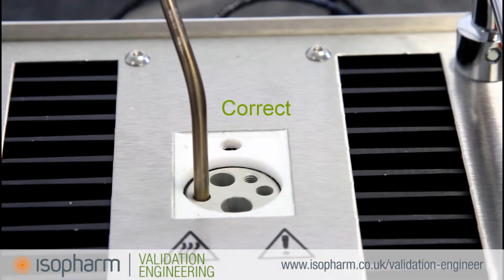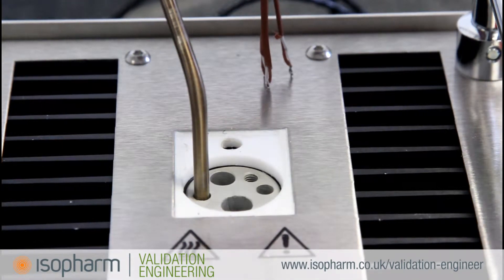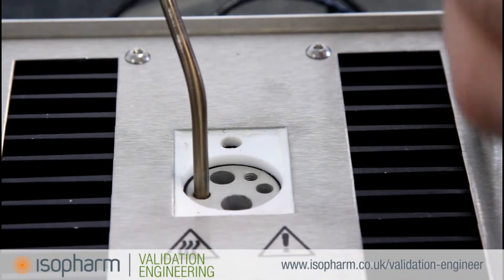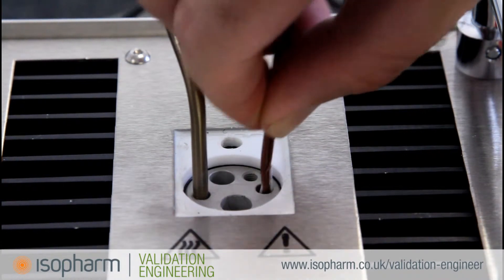Gather enough thermocouples to fill one of the holes in the well. This will minimise airflow and improve calibration accuracy. Ensure the thermocouple ends are level and insert the bunch into the well, ensuring that all the thermocouples are positioned at the bottom of the well.